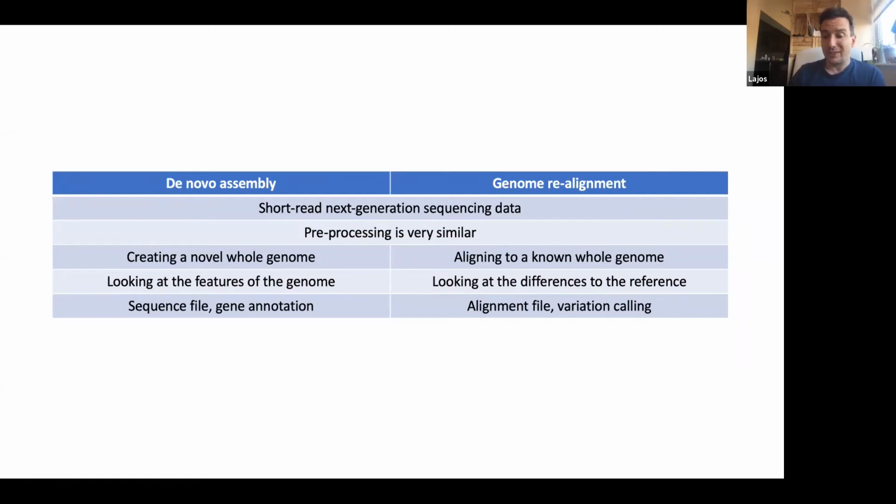So it can happen that, for example, you are sending a sample to sequencing and you want to do de novo assembly, but you get back a little bit crappy data. But actually, maybe you don't have to throw that crappy data out. If you are, for example, looking for an MLST, or you want to make a phylogenetic tree or put that sample into a phylogenetic tree, or you are looking for specific genes in the sample, you don't really have to rely on the de novo assembly always.